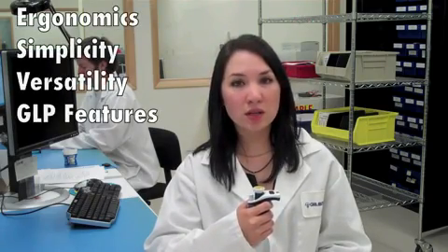Hi, I'm Nicole with Gilson, and I'm here today to introduce you to the Pipetman M. This is the first of four videos, and we are going to cover the basics on the product. In this video, I will cover the ergonomics of the pipette, the simplicity, the versatility, and I will also go over the GLP features.